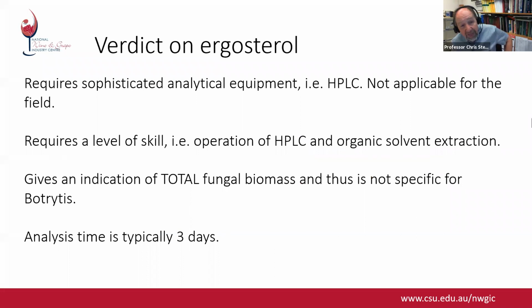So what do I think about the ergosterol analysis? Well, you know, we still need some sophisticated equipment and a level of training and skill to carry out this assay. But some wineries do have HPLC equipment running. But this is analysis time of, we could get it down to 2 days as a minimum. It's actually the extraction part and the equipment that we need for the extraction. It takes a bit of time. But ideally, we're going to need 3 days to do the work and then to work out the data. So again, maybe not so applicable for a field situation.